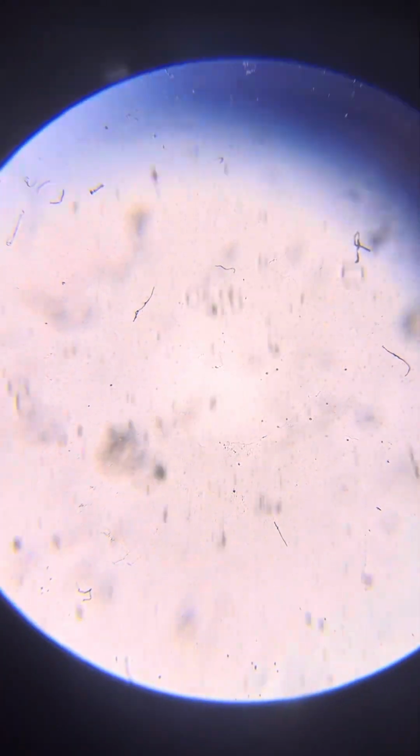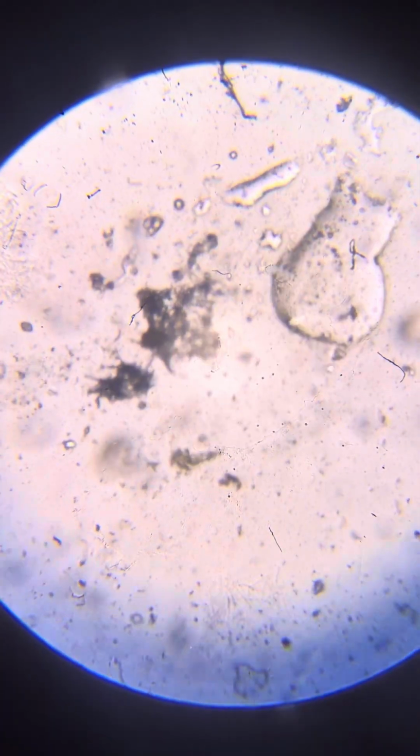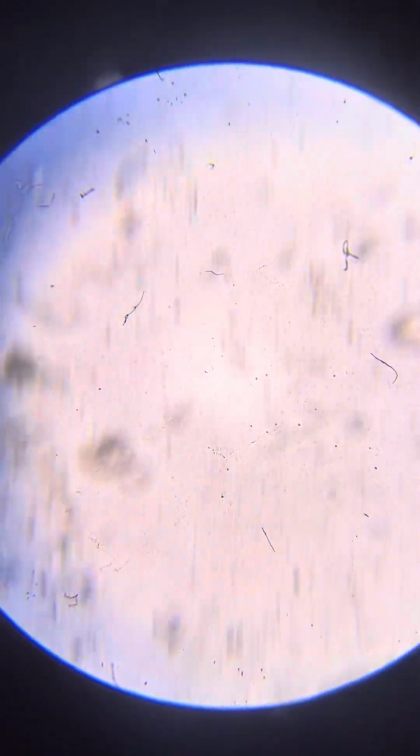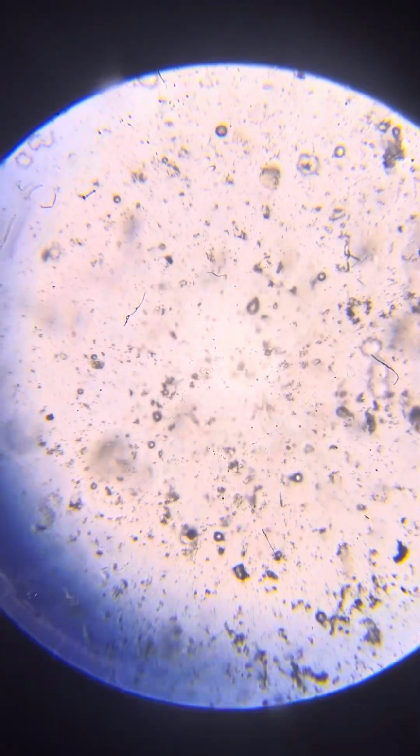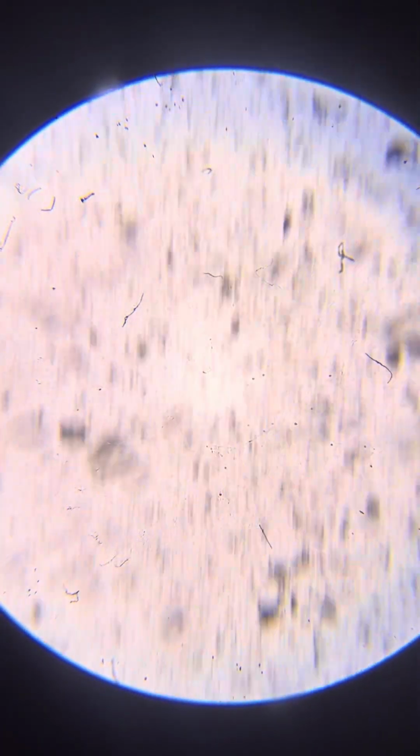Also, there is far less material in this slide, not just from a different place, but a different consistency. We see Neros, of course not the biggest ones, but we see some.